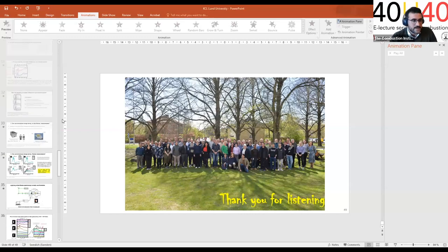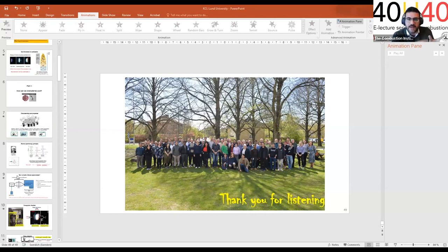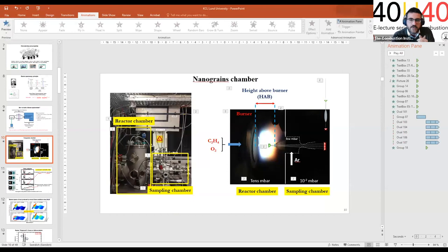So I guess I can start. I have a question regarding the sampling of soot particles, and the fact that doing the sampling actually modifies the structure of soot. Do soot particles behave more like a solid sphere, let's say a solid amorphous object, or are they more like droplets, so they behave like a sort of liquid? So it's this that modifies the structure, the fact that if we put a droplet on a surface, the droplet is going to reduce its thickness and expand its volume. Does this happen for soot as well when you sample it?